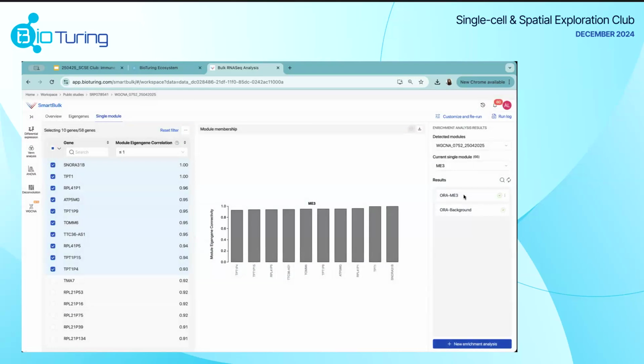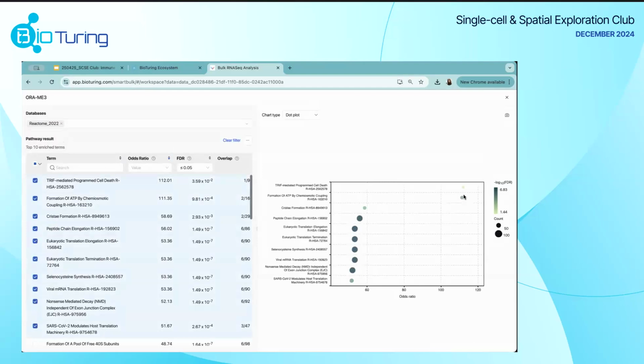So an example, if we do over-representation enrichment analysis, looking specifically at pathways in the reactome system, what we can see is that there are very specific pathways that are giving more insights into these differences across these different groups. So what do we see from just looking at these pathways?